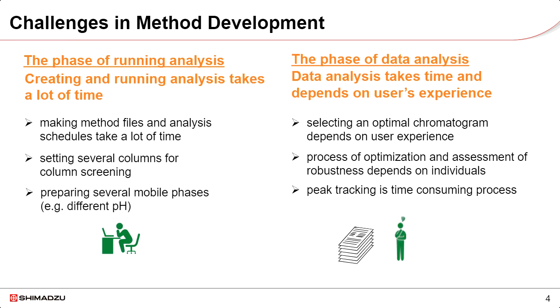Method development does pose its challenges, and broadly, there are two types of challenges that an analyst will face. The first one is the setup of method files, and that includes hardware and solvents that are used to acquire data. There can be plenty of combinations of columns and mobile phases that you'll use in setup of method files, taking you into the even hundreds for a small study. The second challenge is analyzing the huge amount of acquired data. It is tedious, prone to mistakes, and different people will do it differently.